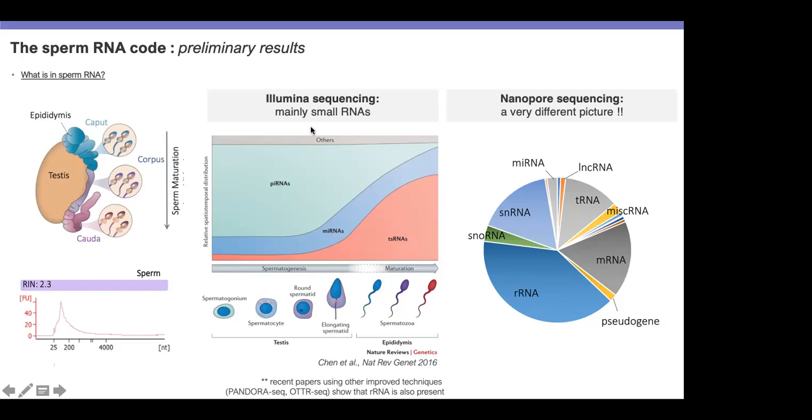But once you move to de novo based calling, like using a model that is trained with modifications, then you don't care about the errors anymore because you're actually predicting the modification directly in the single read, right?